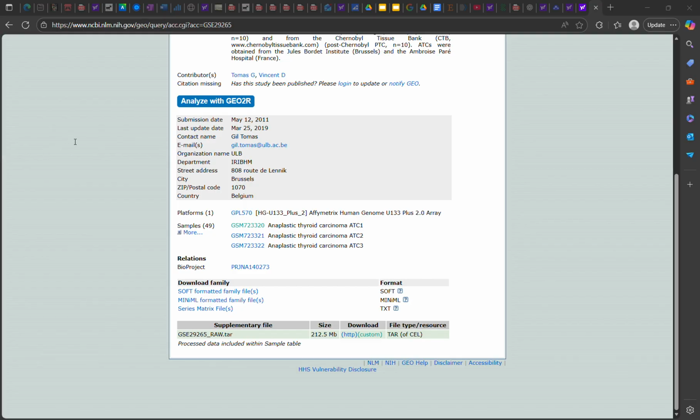Next, we have to retrieve the expression estimates. So for normalized expression, we can retrieve the expressions for normalized data just by running this. Oh, and also, just so you know, you can totally get the normalized expression, normalized data, normalized expression. These are both here. Oh, but first we have to convert the normalized expression to a data frame. So I'm just going to run that.